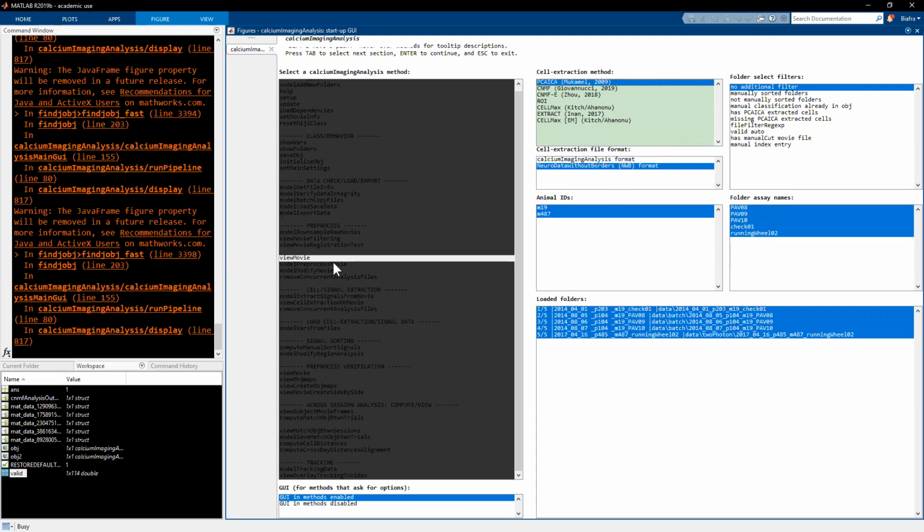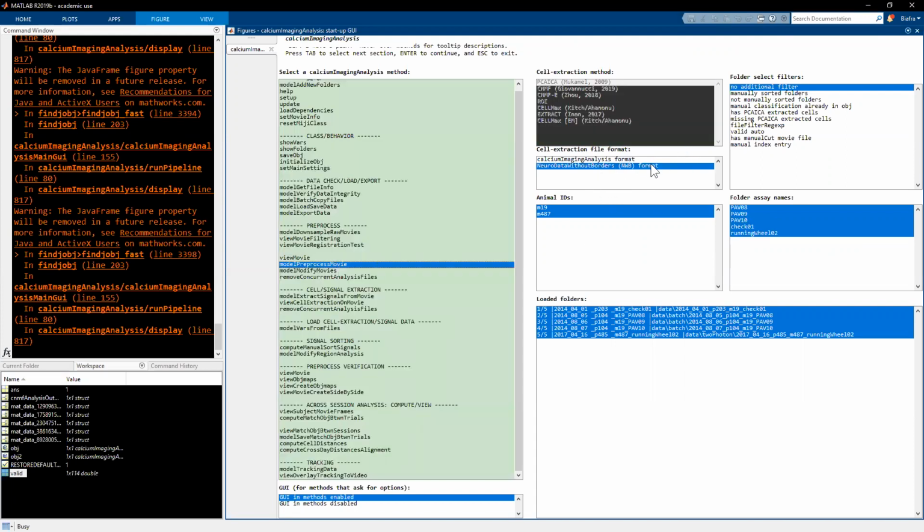As I was mentioning before, one of the nice things, both for NWB and just in general, is that it's trying to set out the provenance of how the movies were saved. And I think at some point maybe that'll be integrated more within a standard. It's always hard to do that with NWB just because different methods have different underlying settings that they use to process the movies.